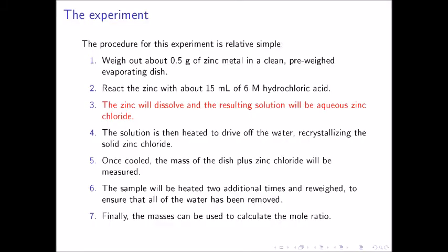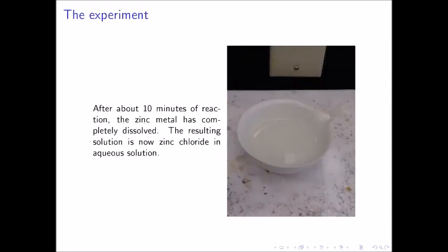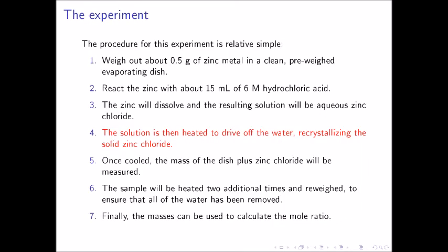At this point, we allow the zinc to completely react with the hydrochloric acid. After about 10 minutes of reaction, the zinc metal has completely dissolved. The resulting solution is now zinc chloride in aqueous solution.